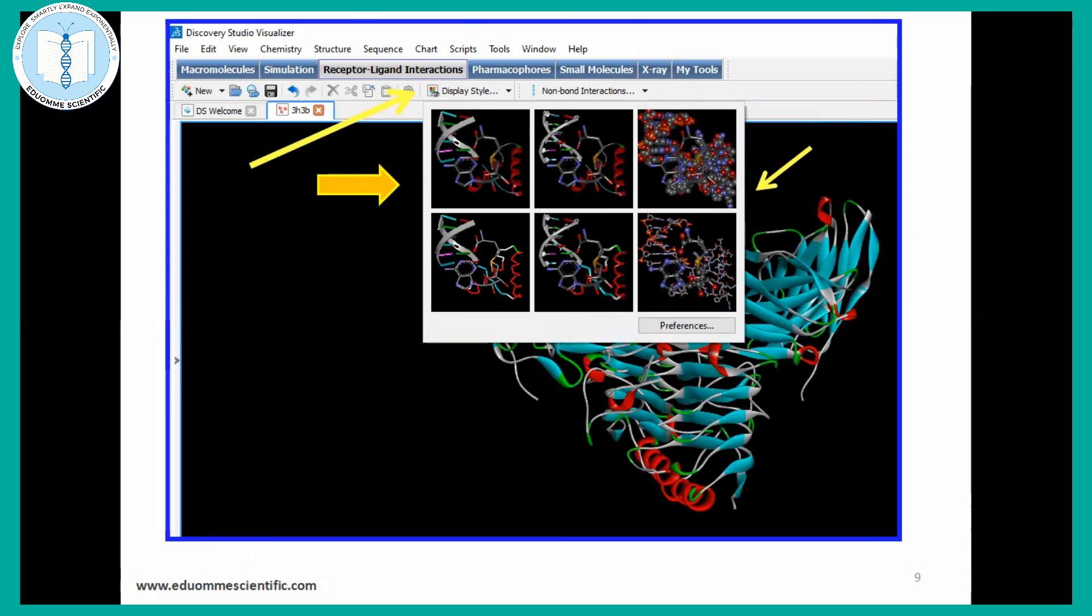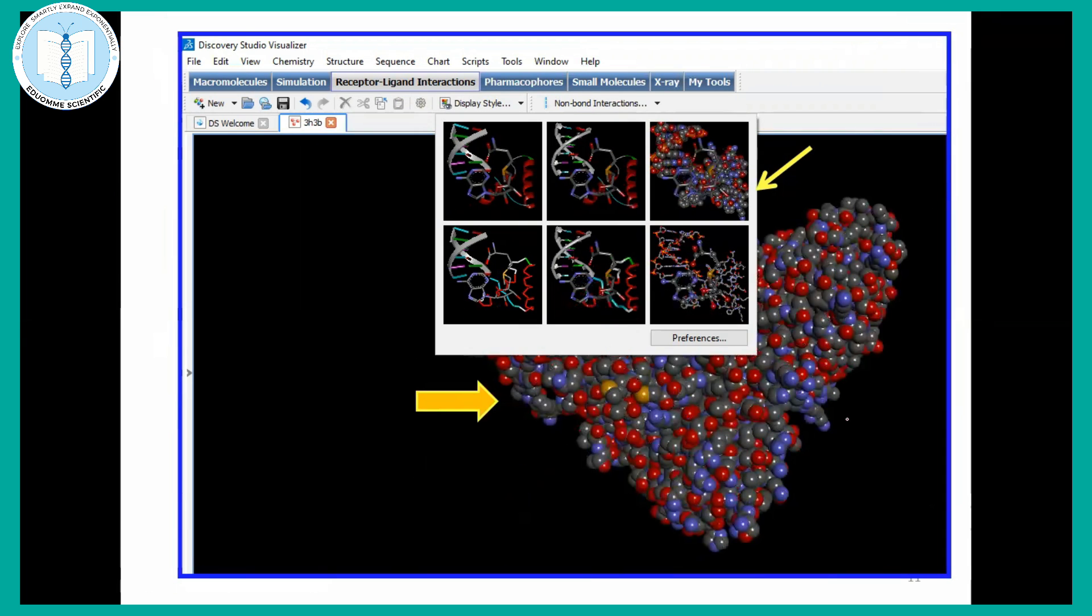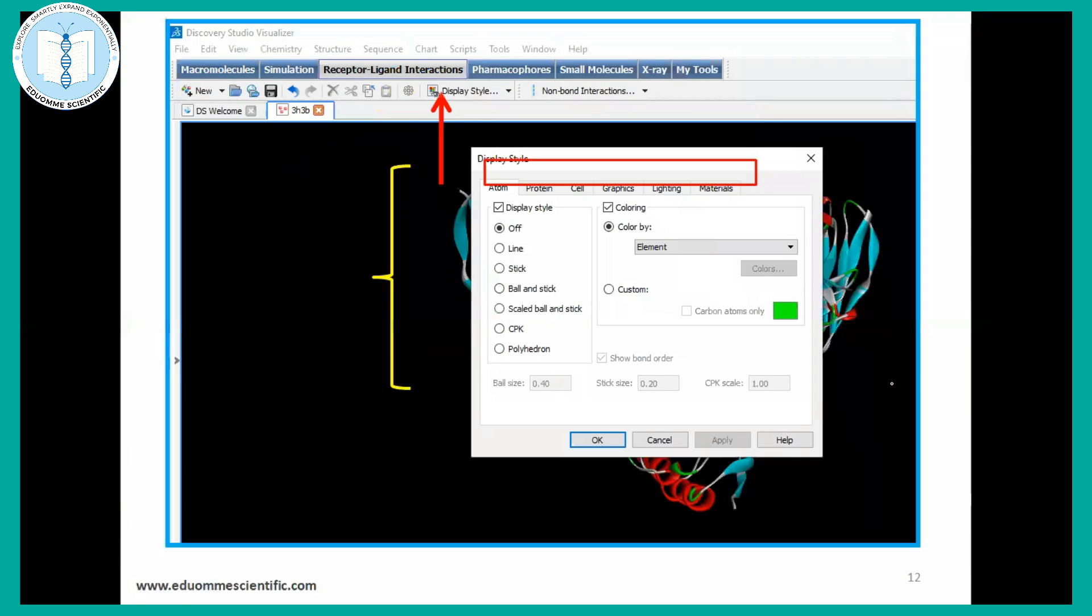Suppose you want to get the different display of your macromolecule in different file formats or different representation like what I have shown you in Chimera also. In a similar way, there are multiple features here. You just have to select these things and you may visualize in different visualization settings. You can go and play with those buttons.